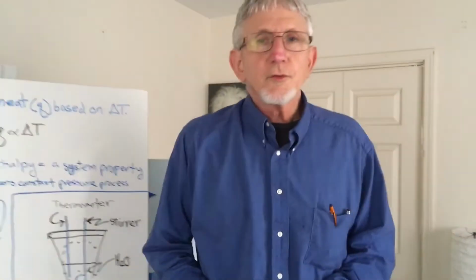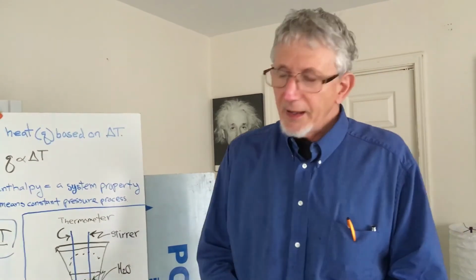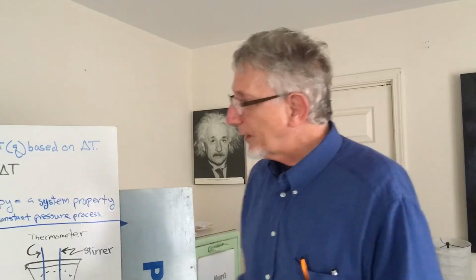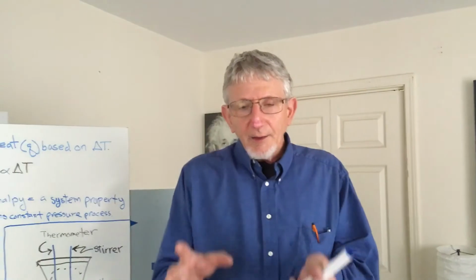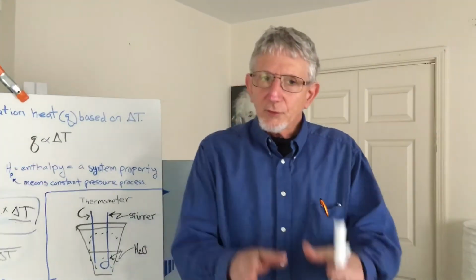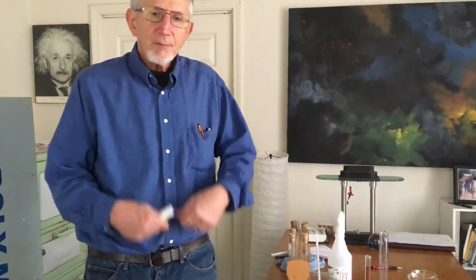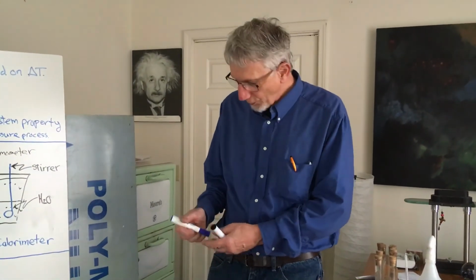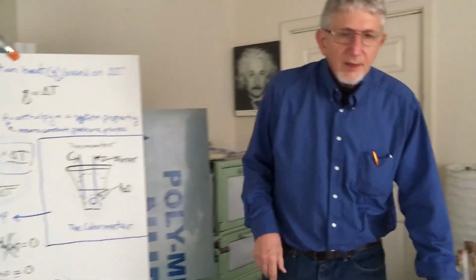And as I said before, you'll do that for 3 different kinds of reactions: a chemical reaction, a physical reaction, and a second kind of physical reaction that will allow us to determine the specific heat capacity of a metal. And we're going to have 3 other little YouTube videos that will describe the steps. I'll show you the steps in using the calorimeter, how the experiment is set up, and how to generate the data. You'll have the data from those YouTube videos, and then you'll use the equations. There's our working equation. This is our working equation to solve for Q. And that's the story.